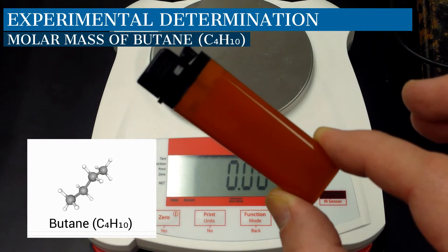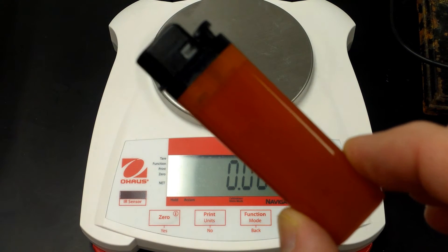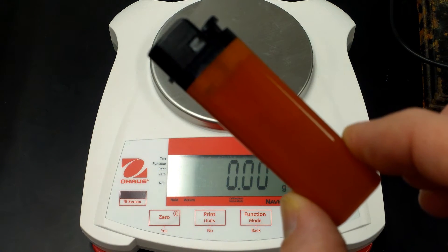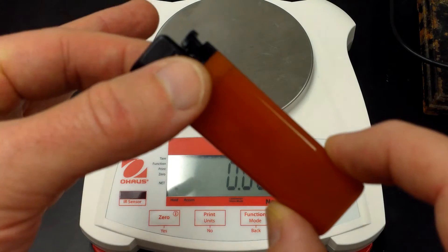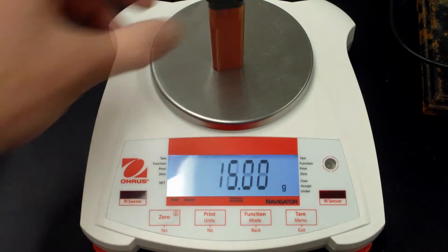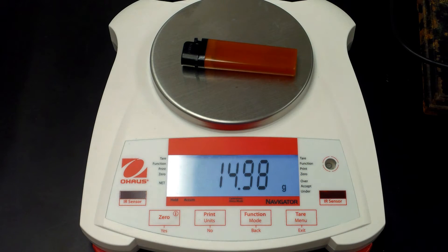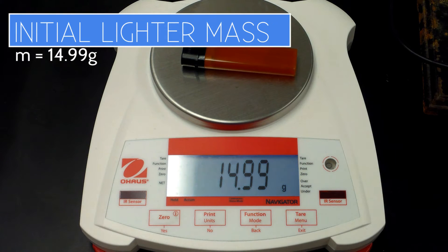This lab is being conducted to experimentally find the molar mass of butane. The first step is to determine the mass of the lighter before the experiment begins, so let's place it on the electronic balance. The starting mass of the lighter is 14.99 grams.